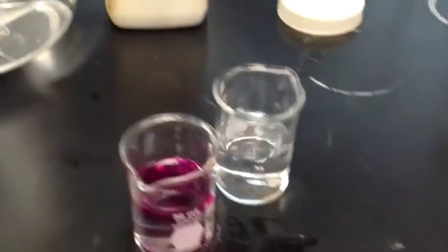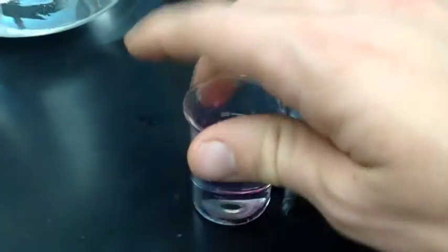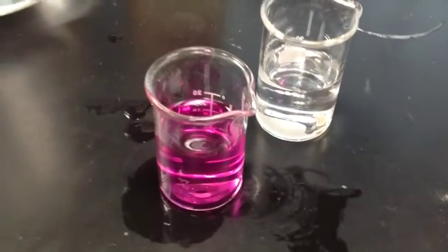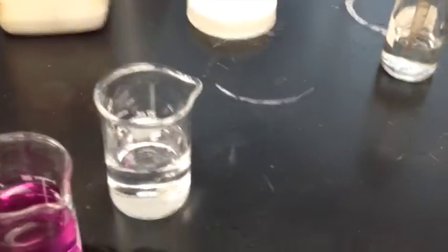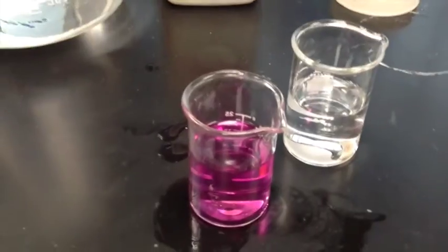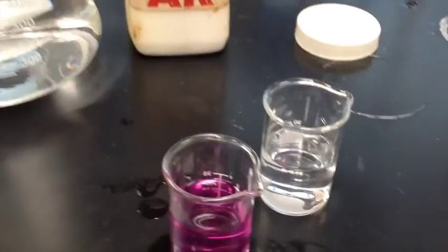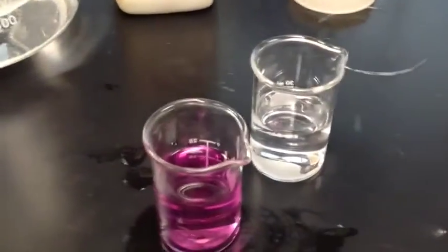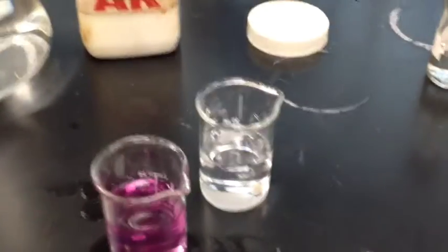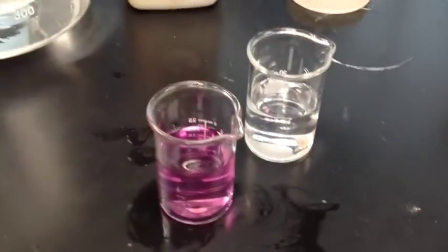So over here we have an acid and a base, as indicated by phenolphthalein. You can see that phenolphthalein needs a pretty good mixing to actually stain the whole solution, but it easily will. It doesn't take a lot. So if we put phenolphthalein in an acid and we add base to it, at the point when the pH crosses from like a 6 or a 5 when it's an acid, through 7 when it's water, up to like an 8 when it becomes a very weak base, the solution's going to go from clear to purple. So we'll know that we've hit what we call the equivalence point. It's a real neat chemical that way, and it works very, very well.